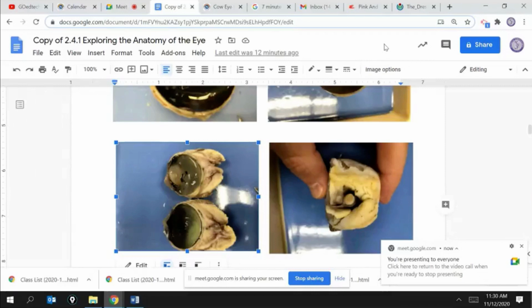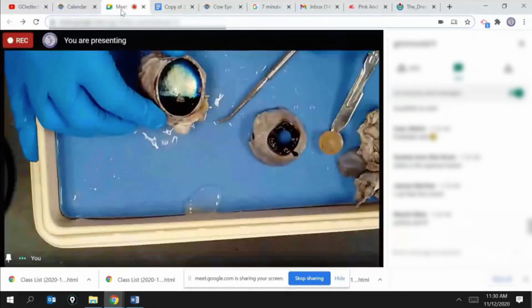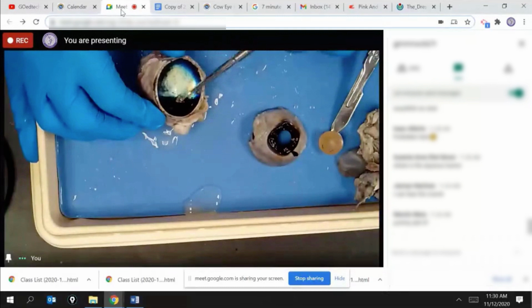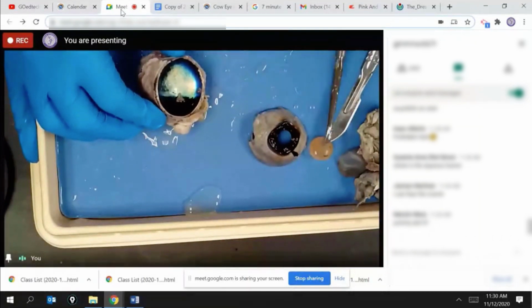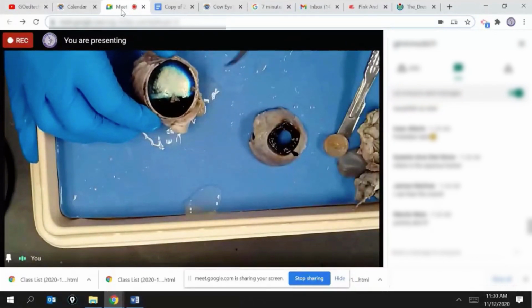Now, as you do that, let's take a look at where that goes. I have all of this neural information that's being taken up by the retina, and where that retina attaches in, if I can get this to come off, let's see if I can scratch it off a little bit. Right here, this becomes the optic nerve. I'm going to show you up here, sorry. Okay, so right here where I pulled this off, that becomes the optic nerve. And the optic nerve is on the very back. You can see where it comes out the back of the eye.